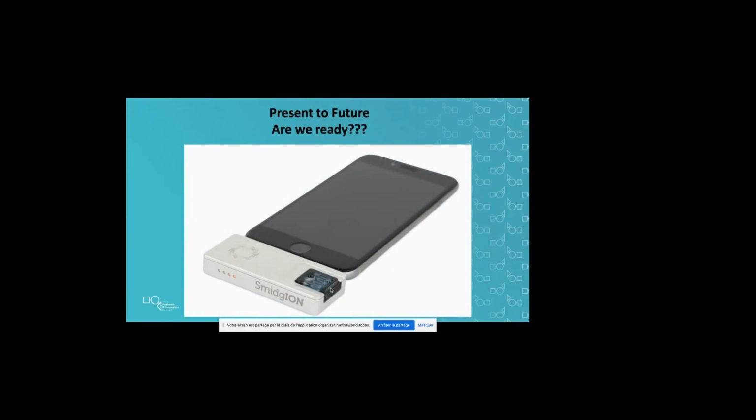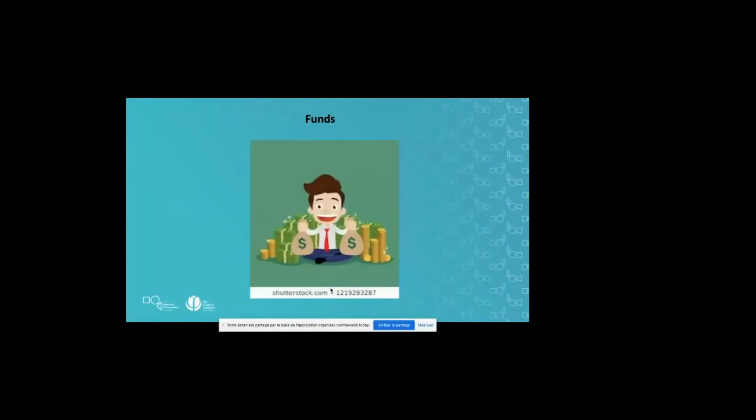So now, after listing many challenges related to NGS applications, I would like to bring you with me into a future projection and discuss possible solutions or alternatives. If we start with the technical side, I think that the technology will continue to advance, but the question is, are we really ready for these advancements in terms of data storage, result interpretation, and the legal framework?